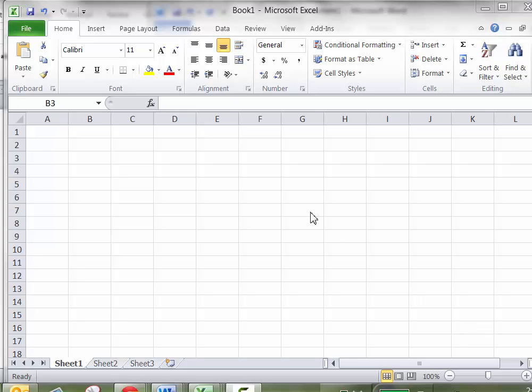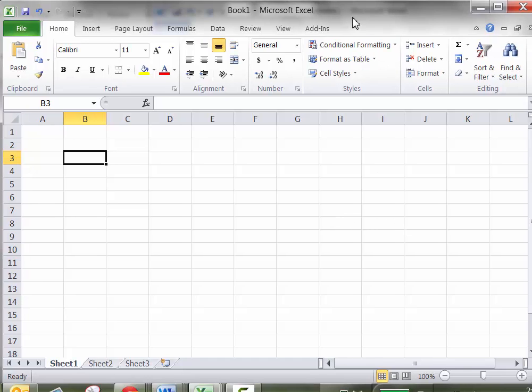So to begin to make your Beer's law plot for your colorimetry data, we are going to want to first open up a new window in Microsoft Excel. Okay, and you can either manually type in your data here, so you can do absorbance versus concentration by typing in that data, or if you have that text file exported from your colorimeter, you're going to want to open that.